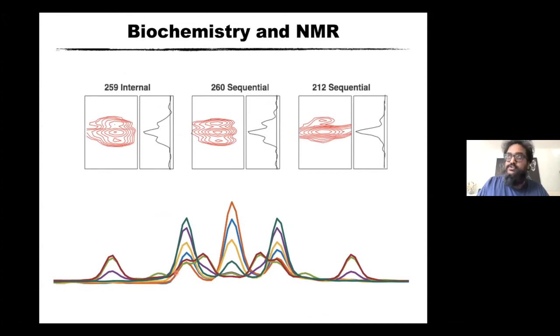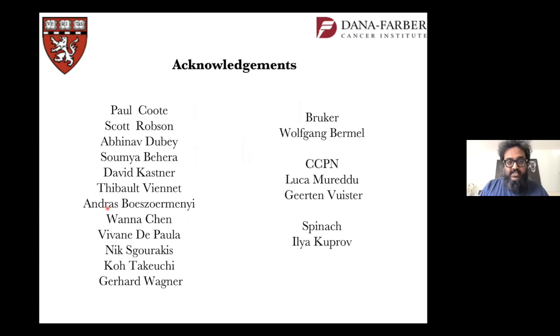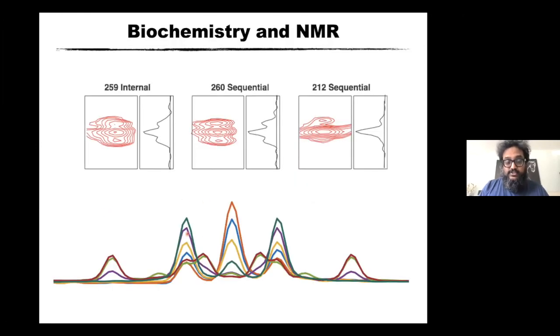So I've showed you two different techniques. One using biochemistry, where we use the pyruvate and the way the pyruvate gets incorporated into different amino acids to create peak shapes. And the other is using optimal control theory. These two are not orthogonal. I can take a pyruvate sample and then use these pulses to further get delineation. So again, this is a new way of using spectroscopy and biochemistry to get amino acid specific peak shapes and then use them in assignment and also to get information.